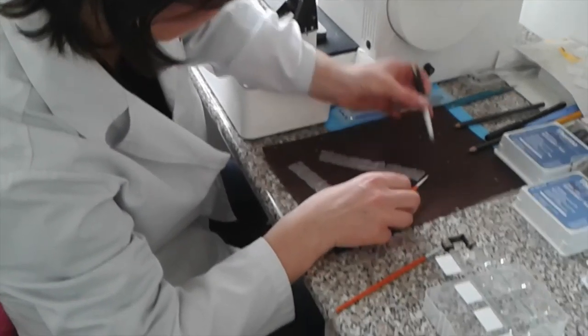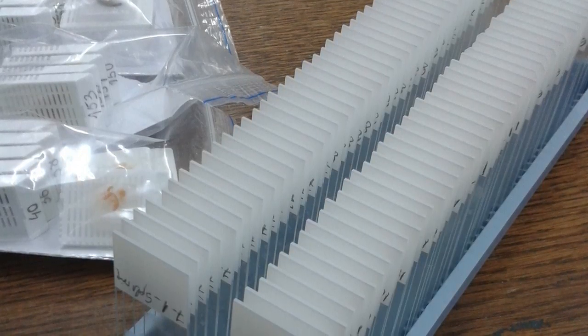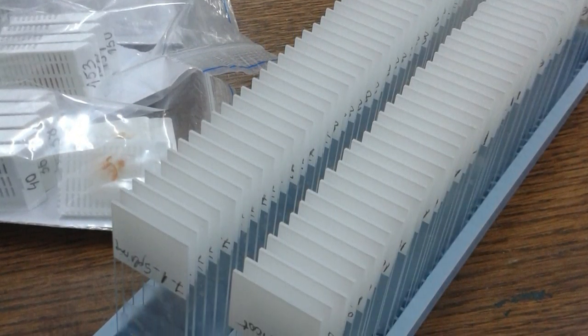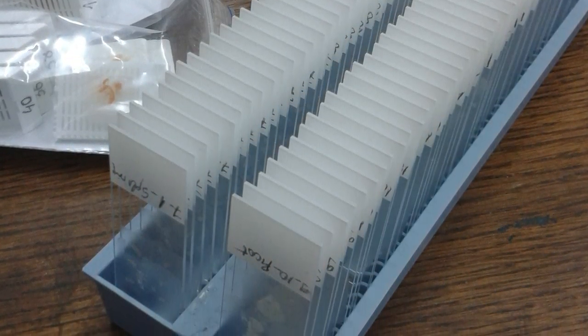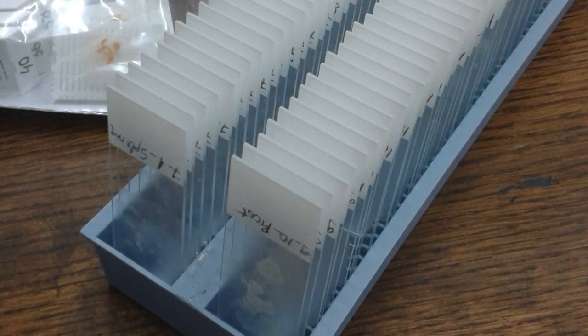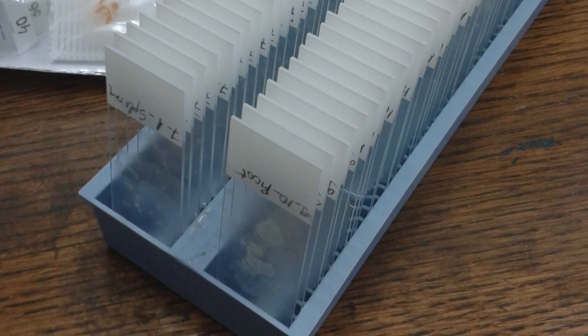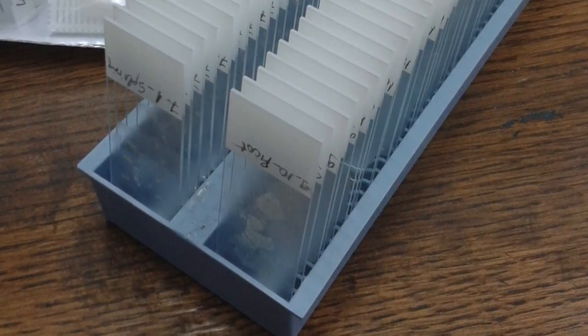Finally, we obtain the slides with the paraffin embedded specimens after they were sectioned, dried at 37 degrees Celsius overnight plus 2 hours at 60 degrees Celsius and cooling at room temperature. These slides will go through staining, cover slipping, sealing and mounting.